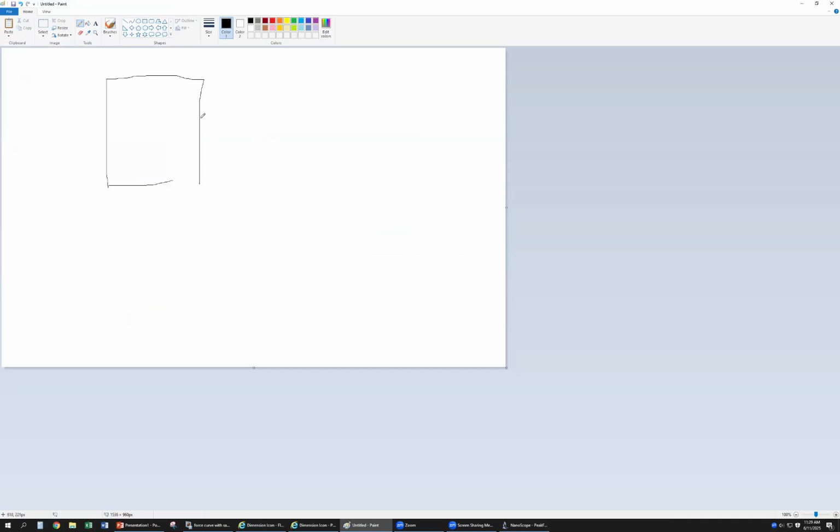If the probe is a silicon probe, an etched silicon only, like the SNIR, then the RTSPA, this kind of probe. If it's a new one that has never been opened, then the website will provide this value, which is around 5 to 10 nanometer. Yeah, it's a silicon one.